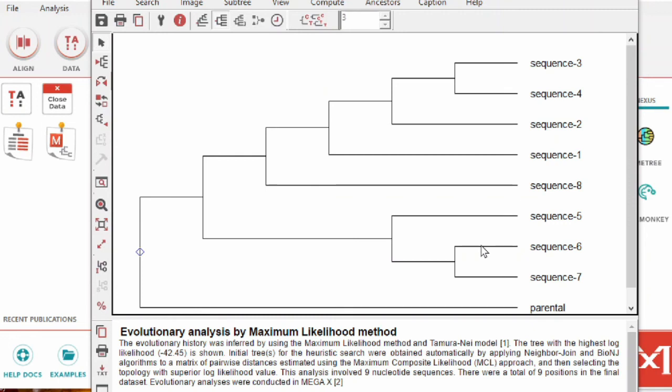So please construct the expected matrix and then see how your matrix deviates from the expected. Also look at the phylogenetic trees coming out of your reconstructions in comparison to what you would expect. Don't forget the parental should be included and the trees should be rooted.